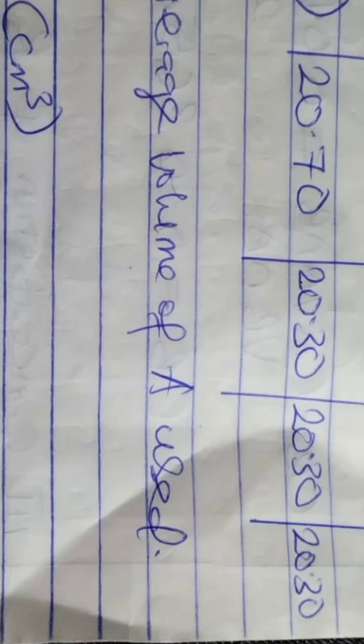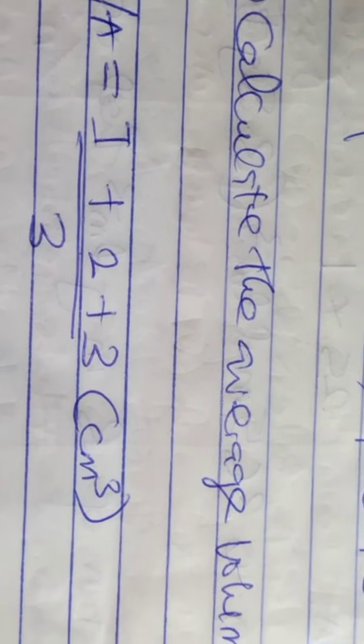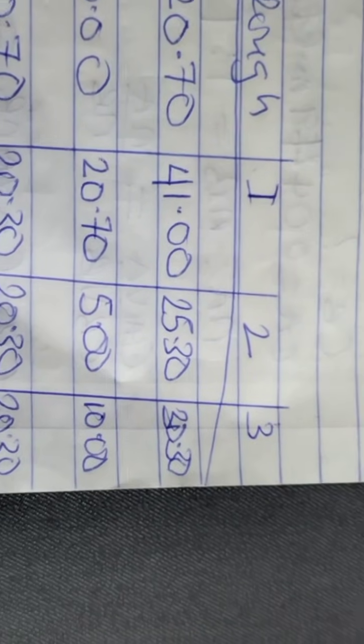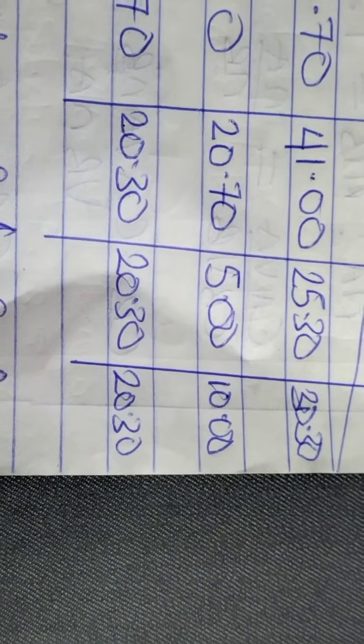It says, calculate the average volume of A used. That's our VA, which you normally call your endpoint. Our VA now becomes 1 plus 2 plus 3. Taking 1, taking 2, and 3. We took 1, 2, and 3 because they are consistent. Readings are concordant. They are in agreement.